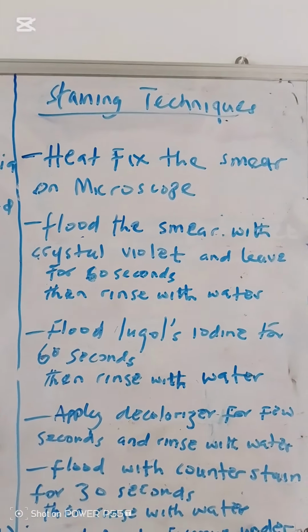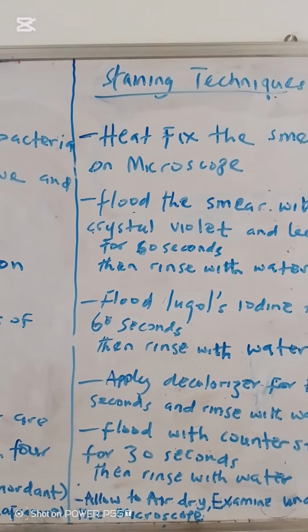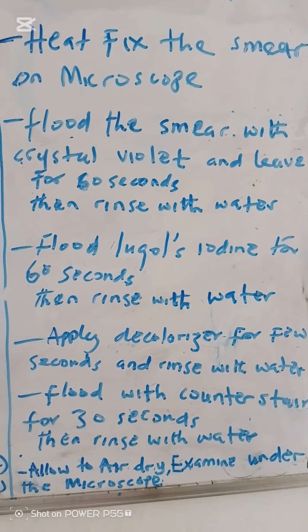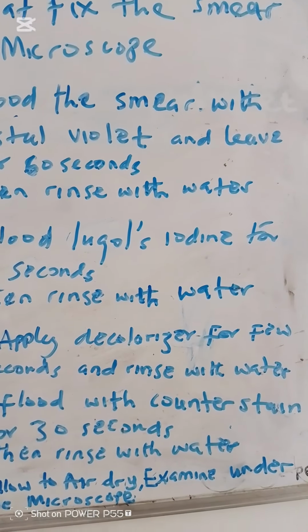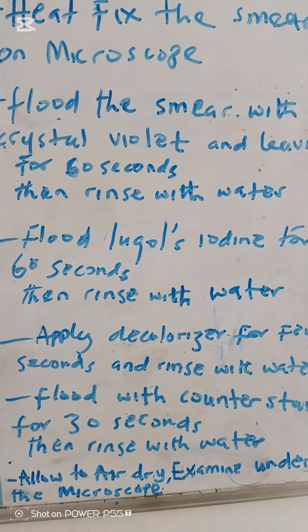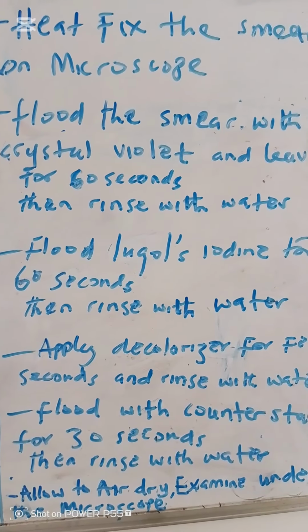Now, the staining technique. You fix the bacterial smear on the microscope slide, and you flood the smear with crystal violet and leave for 60 seconds. Then you rinse with water. Then you flood with Lugol's iodine for 60 seconds and rinse with water. Then you apply the decolorizer for a few seconds and rinse with water. Then you flood with counterstain for 30 seconds, then rinse with water. Then you allow the slide to air dry and examine under the microscope under the times 100 objective.